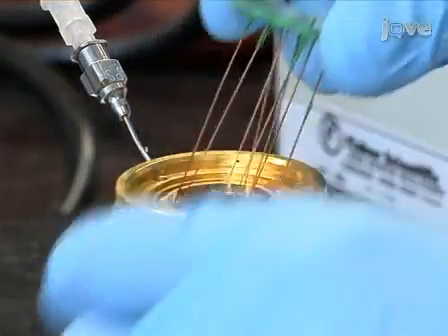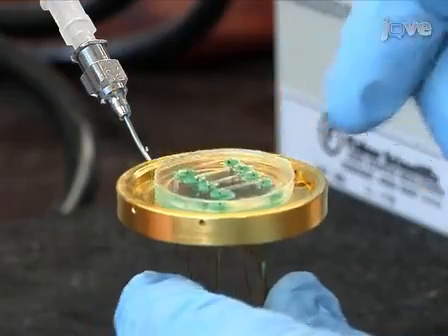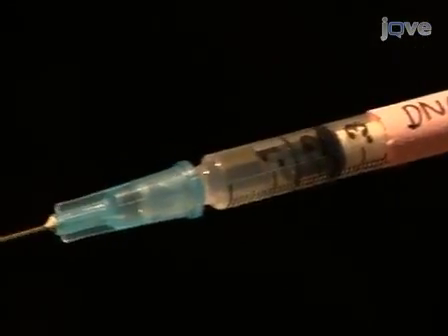Hi, I'm Nicholas Di Fiori from the laboratory of Professor Meller in the Biomedical Engineering Department at Boston University. Today we will show you a procedure to obtain single molecule FRET traces from immobilized nucleic acids using a confocal setup. We use this procedure in our laboratory to study nucleic acid dynamics and nucleic acid enzyme interactions. So let's get started.